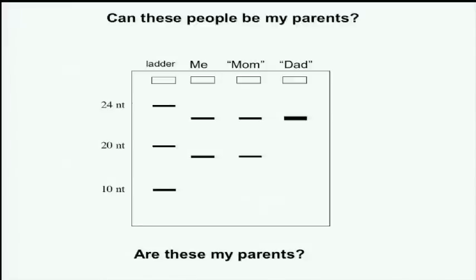So I want you to discuss as a group whether you think these people can be my parents based on this gel, and whether this gel shows you that these people are my parents. And we'll discuss the answers when you come back.